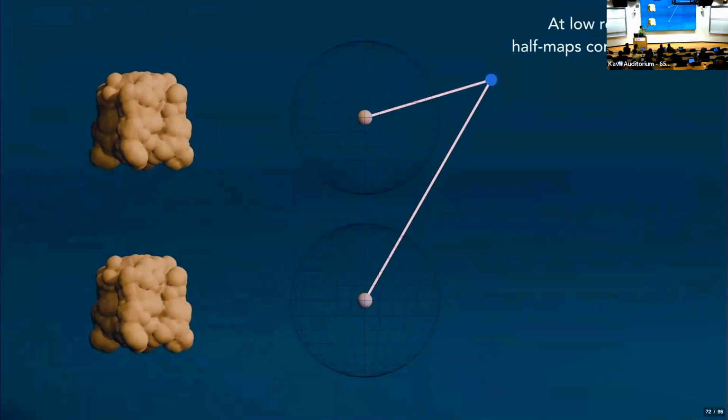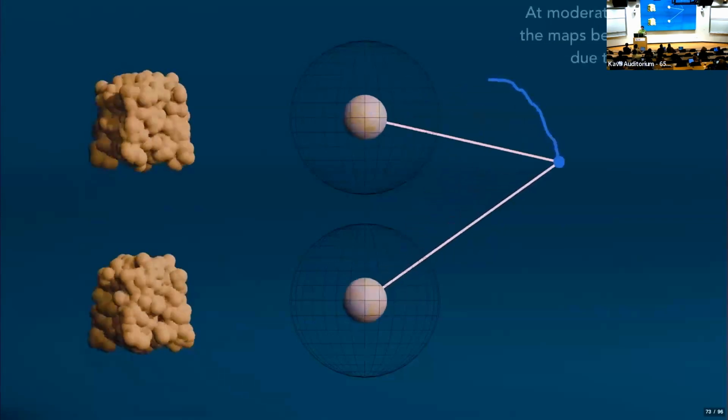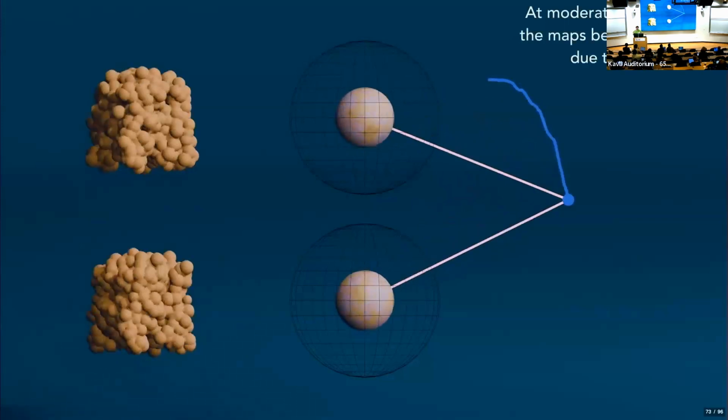When you think about the correlation at a certain frequency, this Fourier shell correlation, in these half sets, anything that's really there should be there in both. So they'll correlate. Anything that's just noise you've overfit, because the noise is different in each of the 2 half sets, it'll be different when you try to calculate the correlation. So basically, by measuring correlation, we're measuring reliability. How much is this in both of our independent half sets? So at low resolutions, we're basically just saying, is there a blob there, yes or no? So they correlate really well. When we go to middling resolutions, we've started to introduce some noise, right? There's a bit of overfitting happening, so the correlation is not perfect anymore.